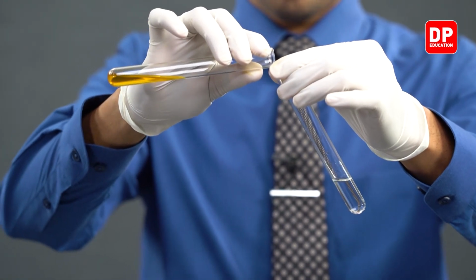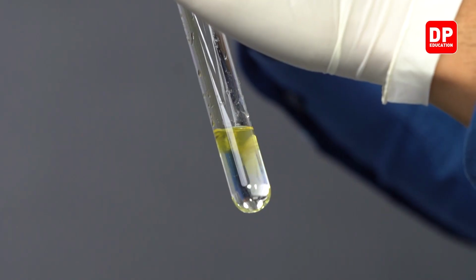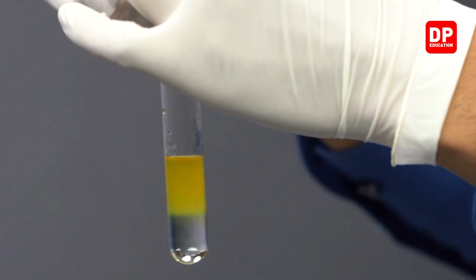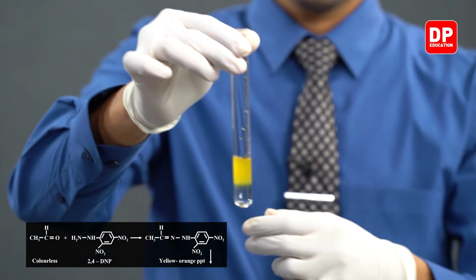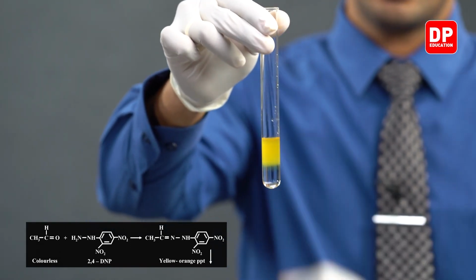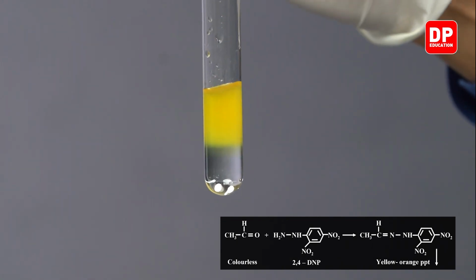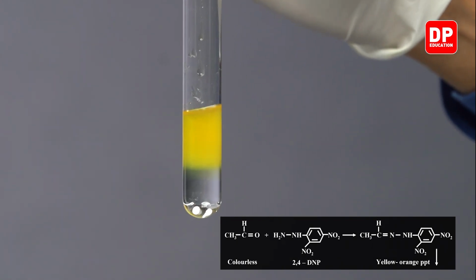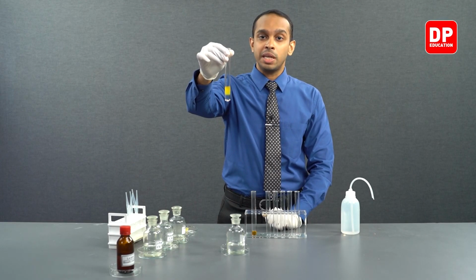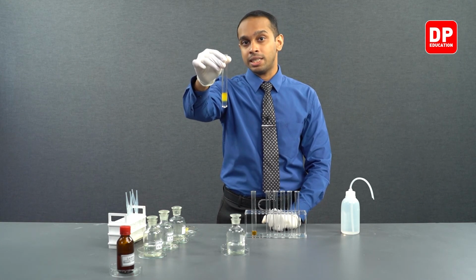Please note the observations when I mix these two. As you can see, as soon as 2,4-DNP is added to this aqueous ethanal solution, we started forming a yellow-orange precipitate. So this yellow-orange precipitate is the positive answer to the 2,4-DNP test.